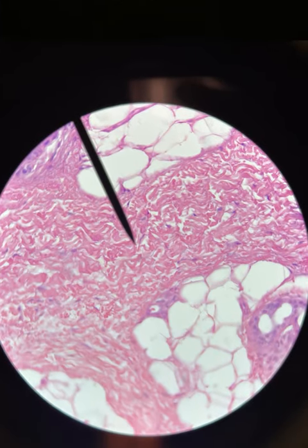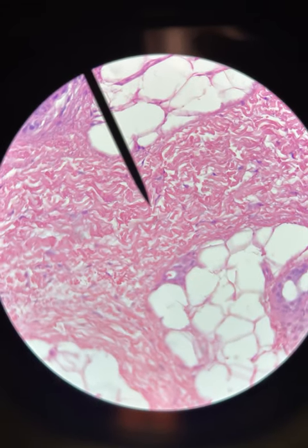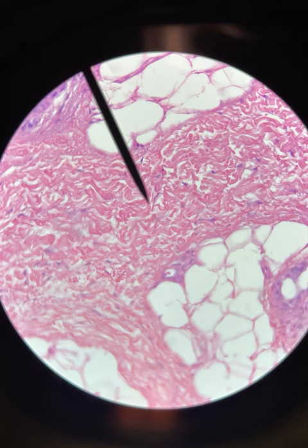All that good stuff. Okay, here we have some connective tissue, and what we're looking at is a dense, right? A very compact, dense, irregular. So they're kind of wavy.